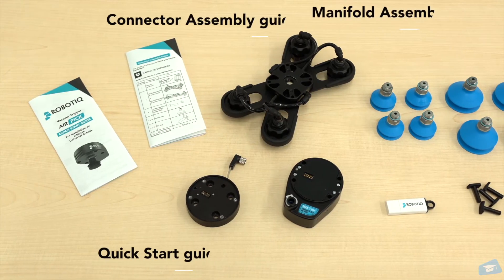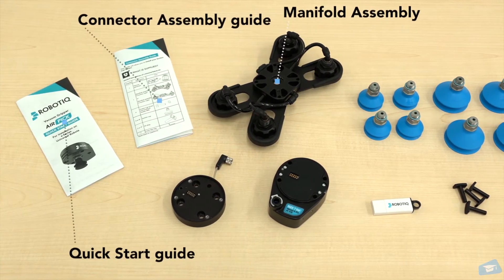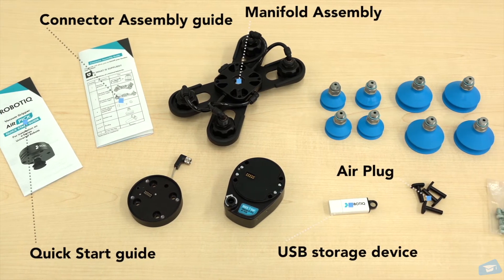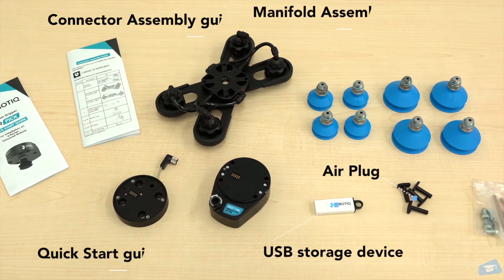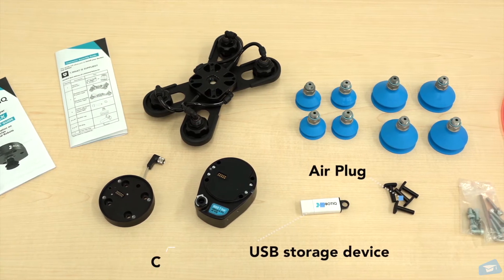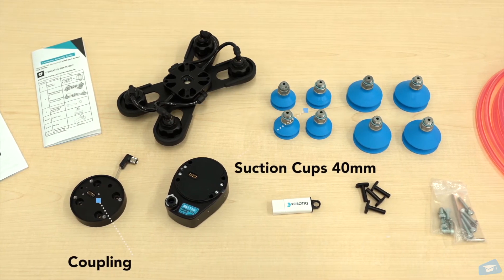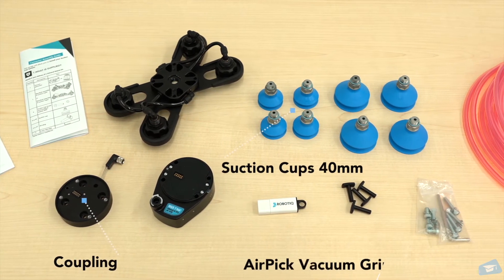Here are the components of the Airpick Vacuum Gripper Kit. As reference tools, the Quick Start Guide as well as the Connector Assembly Guide are available for its users.